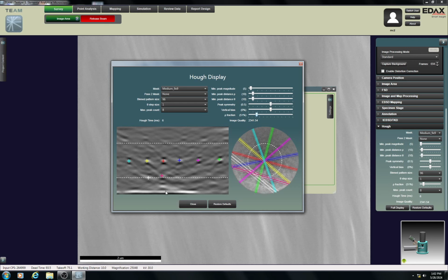If we want to exclude that from the analysis, we can tune the row fraction value to chop that off. By default, it won't include the whole camera anyway, but you can always do that. And this blue band is right near the edge, so if I want a better view on that, I could make the row fraction a little bit bigger, and then maybe you would catch that with a better result.